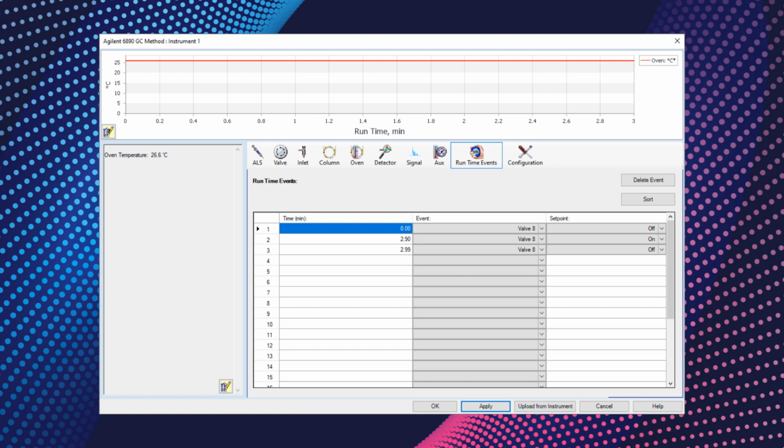Any method not modified will work as usual, but will have the Discover continue to the max end time input in Discover 10's edit sequence.